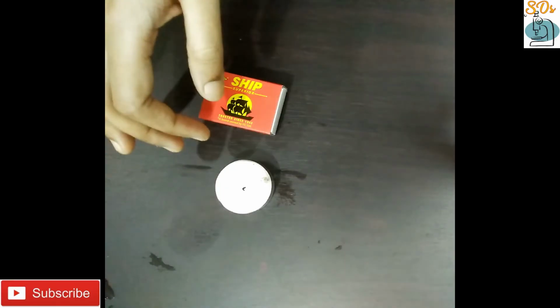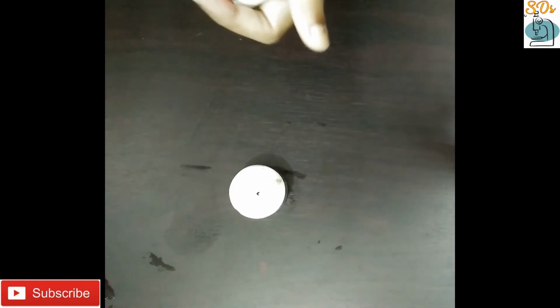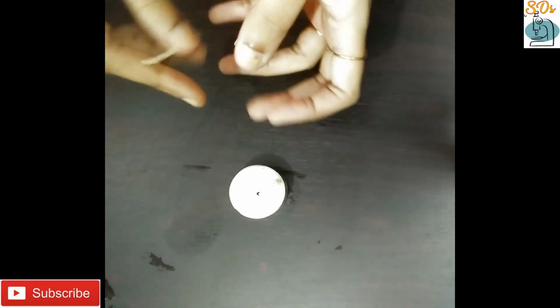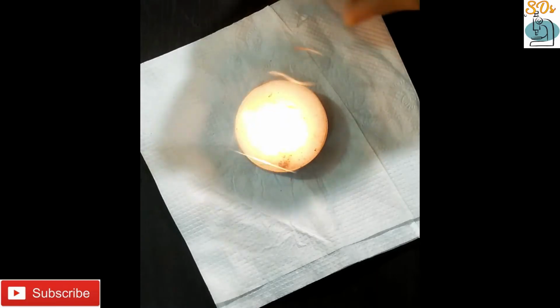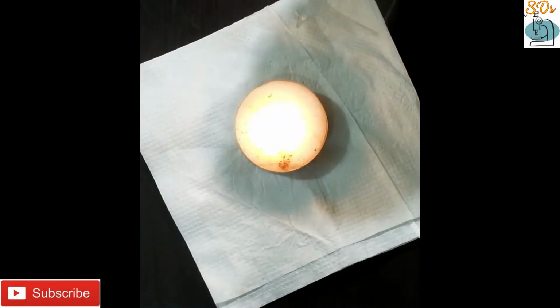15 minutes over. I take one candle and matches. Heat lightly on the burner in such a way that the stain does not dry up. Warm the slide gently for about 1 minute. Do not allow the slide to get hot to the touch. You don't want to cook either your fingers or the root. Do not let the root dry out. This step will not be required for the Feulgen stain.